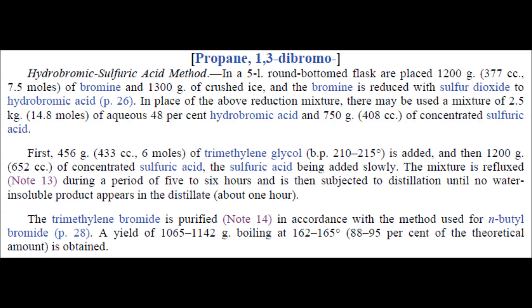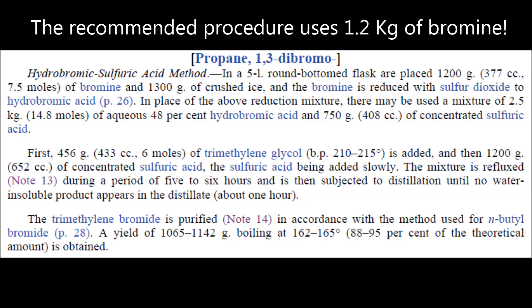Without further ado, let's get on to the preparation. The procedure actually comes from 1921, if you can believe it, straight from the journal Org Syn. The chemists back then were absolute mad lads, and even though I did this on a 10% scale, I still needed a 1-liter flask to do it.